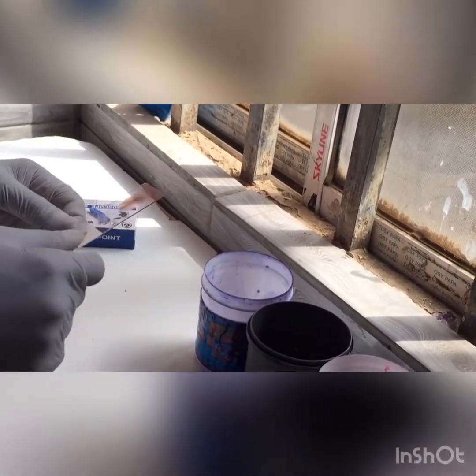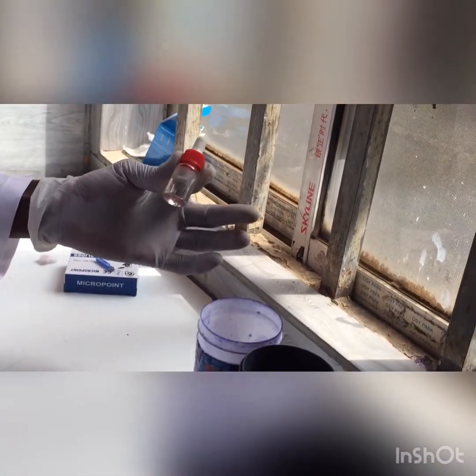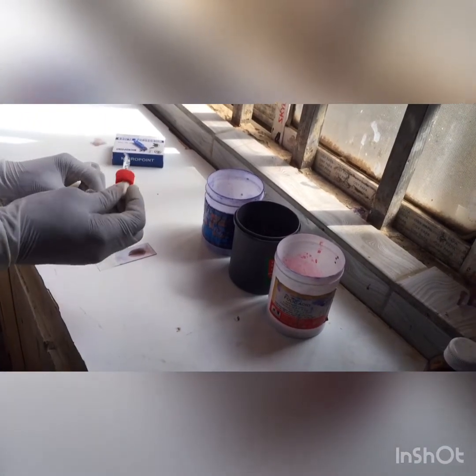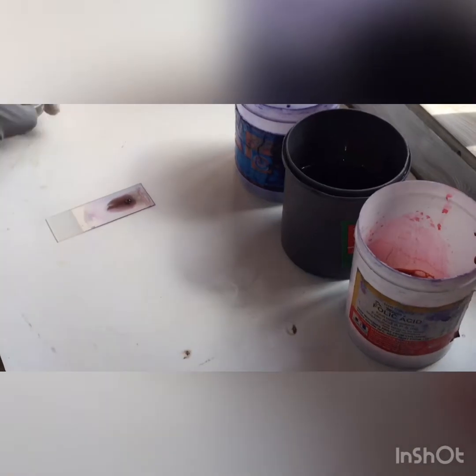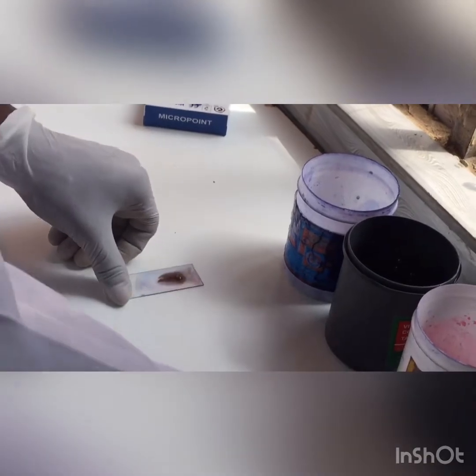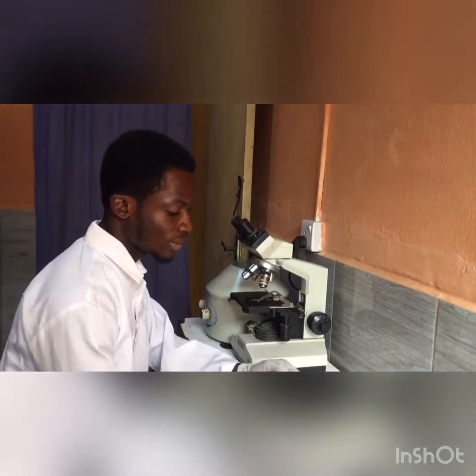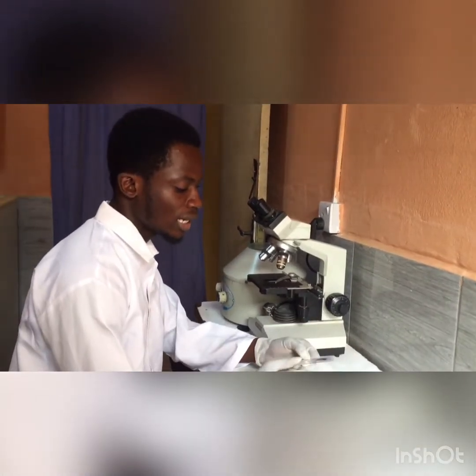Now I'm going to use my oil immersion — just a drop of the oil immersion. I've had some oil immersion already put in this container. I'm going to take a little drop and place it on the slide. Just a little drop, because if you put too much oil it will cause overflow. So now, after staining my thick blood smear, allowing it to dry, and adding my oil immersion, I'm going to view it using the microscope.